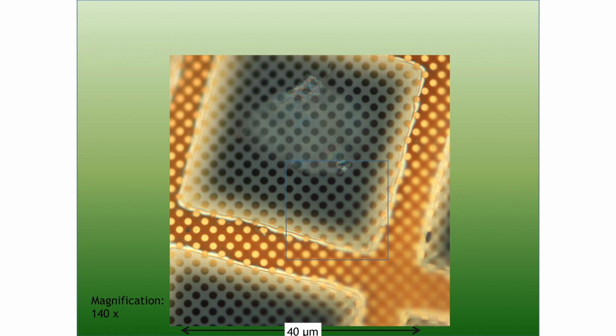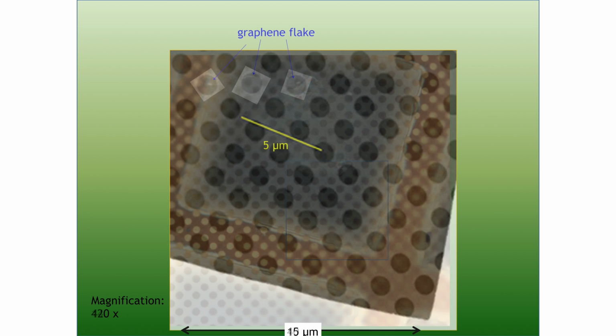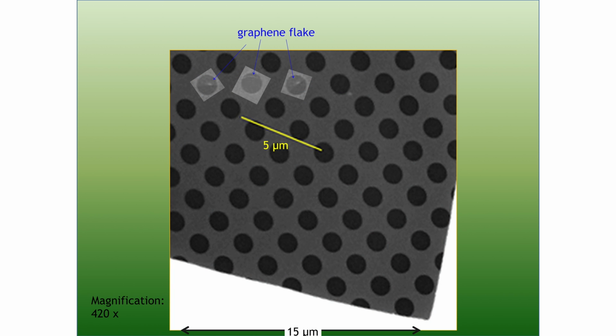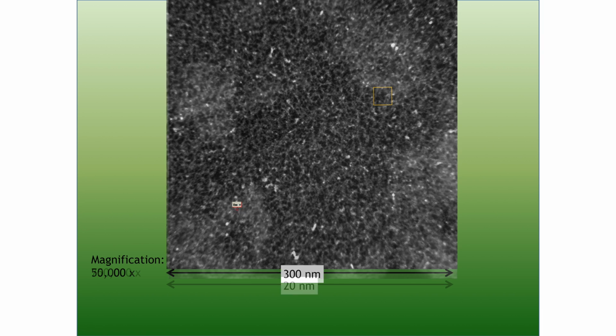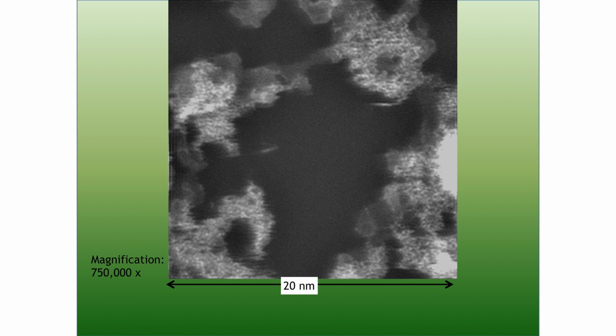and that is the end of the enlargement you can get with a light microscope. So now we've put it into the electron microscope, and you can just see in the top there is a bit like a transparent eyelid. There is this flake that was just shown before, and we're now on the micron scale, and we go in, and disappointingly what we see is just crud, so that's the contamination of the material, which is usual.